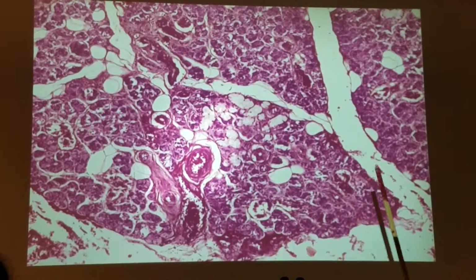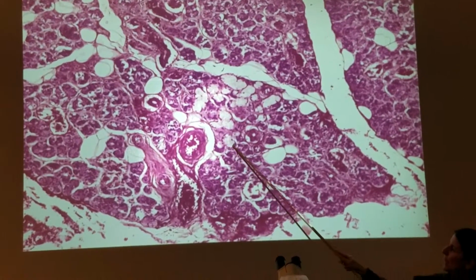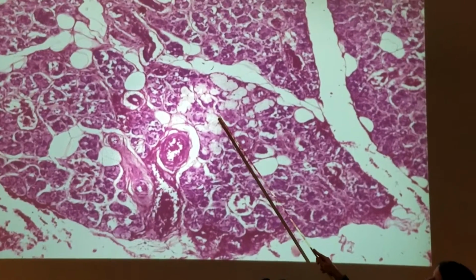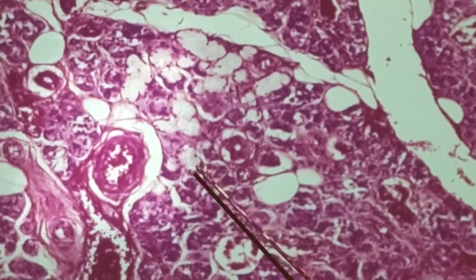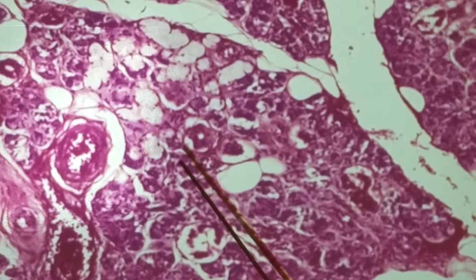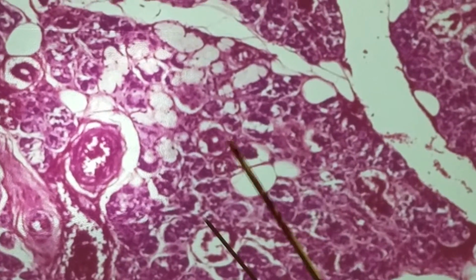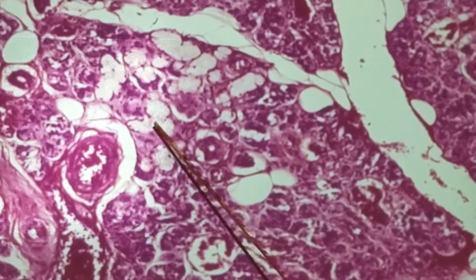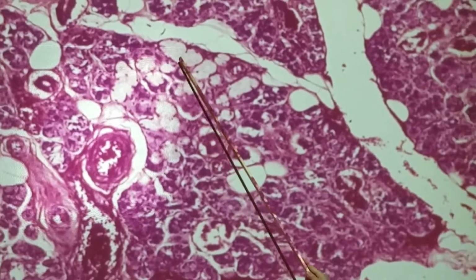When you look at this, the mucus acini are these blobs of cells, and you can see these little black dots toward the outer edge of the cells. Those are the nuclei, maybe 2 or 3, kind of looking like clouds sitting there. So these are all the mucus acini, and it looks so much better in here. I don't know why they look so good here, but these are the ones.